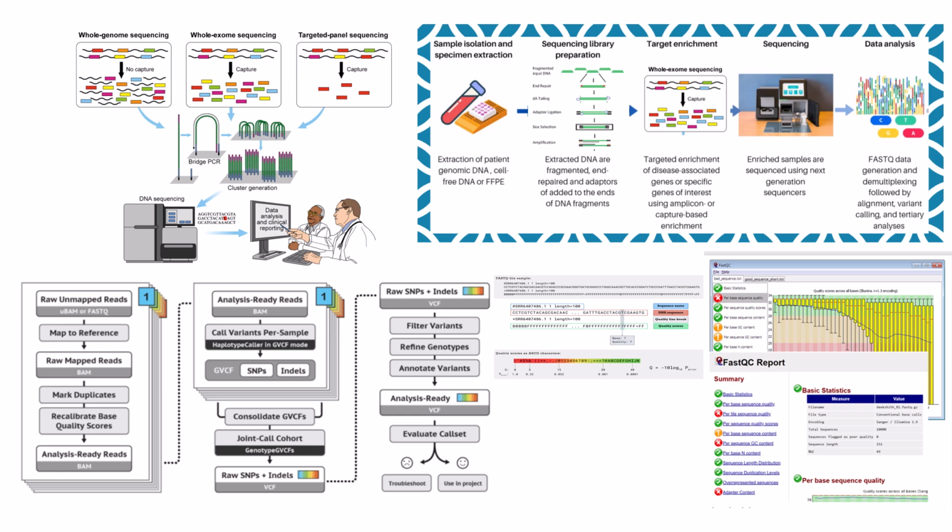But even once they're aligned, there's still a bit more processing needed for top accuracy. Like what? Well, one really important step is identifying and marking duplicate reads. During the lab preparation process, purely by chance, some DNA fragments get copied multiple times before sequencing. Okay, PCR duplicates. Exactly, often PCR duplicates. We need to find these because if you have 10 identical copies of a read showing a certain variant, you don't want to count that as 10 independent pieces of evidence. That would artificially inflate your confidence in that variant. So tools like Picard MarkDuplicates flag these. So you're making sure each unique original DNA molecule is basically counted only once.